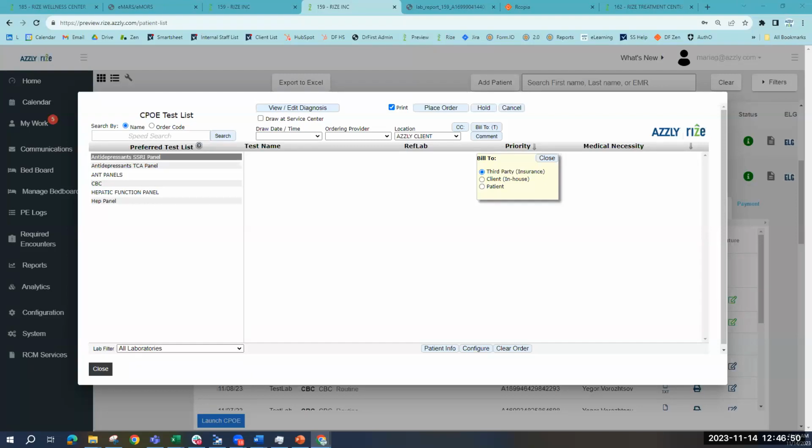So good question. And for those that have attended the call, here comes another. The PDF is the view of the embedded PDF from the lab, correct? Daniel's answering this one. This is from Noah. Yeah, so I just typed in there, but the answer is yes. Excellent. And then from Sharika, when you send a result to another provider, will it send as a PDF?